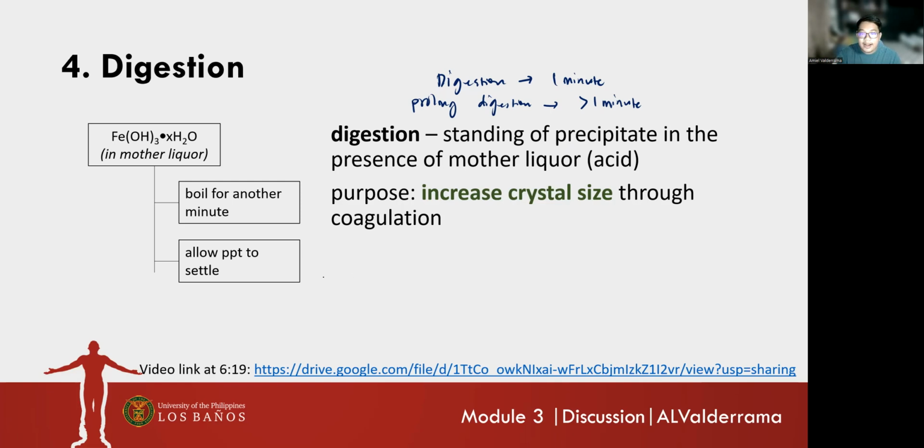So let's have a quick timetable here. Okay. So let's have your precipitate here. This is during the pre-digestion part.